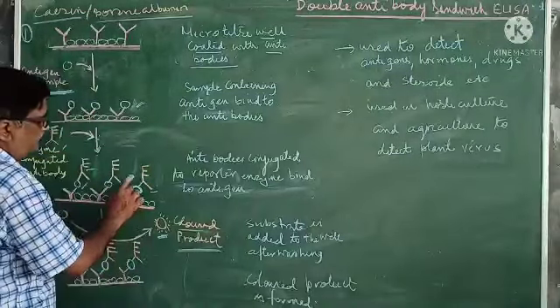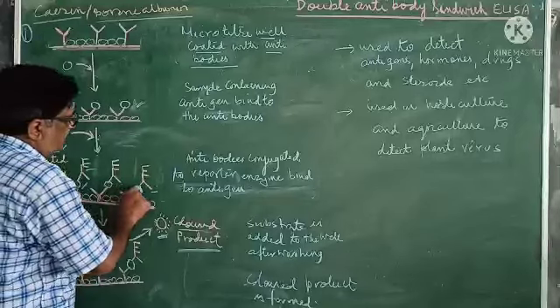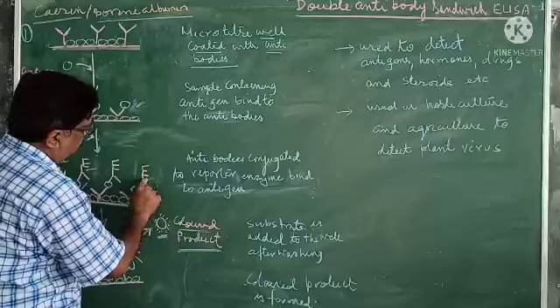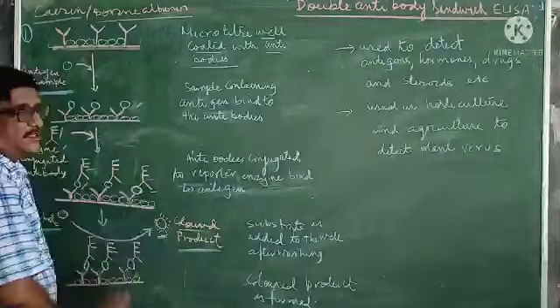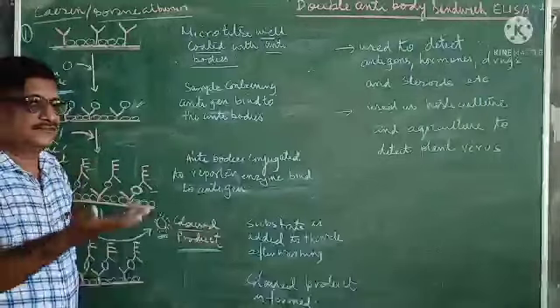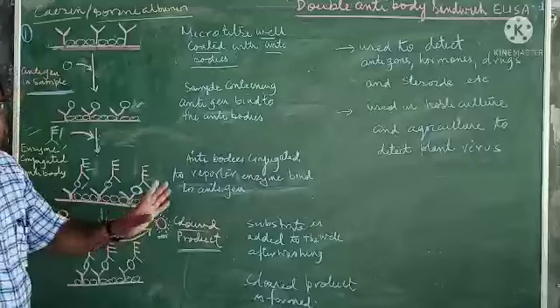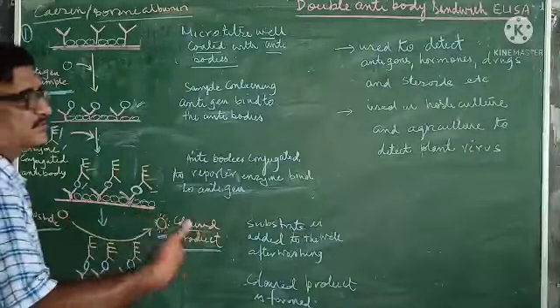If the antigen is bound to this antibody, the enzyme-conjugated antibody will bind to it and remain in the well even after washing, because it sticks to the antigen and will not be washed away.